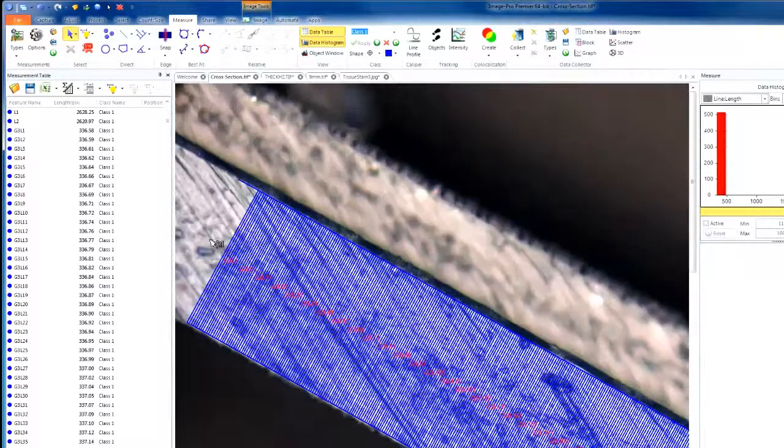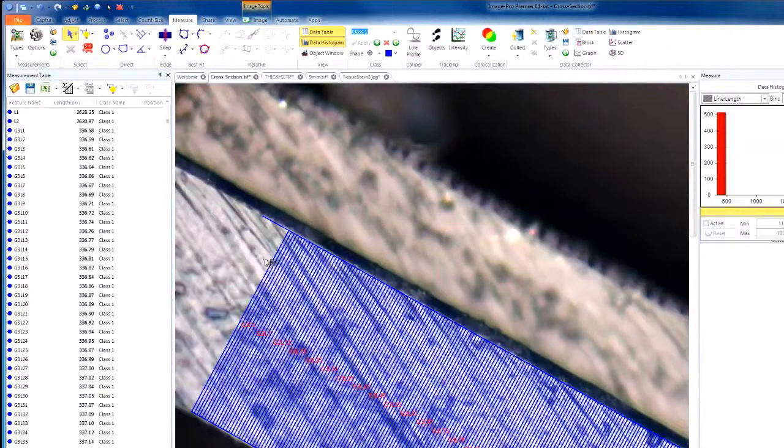We're no longer looking from the object line to the reference, looking for the shortest distance, but instead, we're going to be drawing lines equidistant. If you choose to select this option, Image Pro Premiere draws the thickness sampling lines from the object line to the reference line, and in this case, the step size interval is applied to both lines. Each point along the object line is connected to its corresponding points along the reference line.